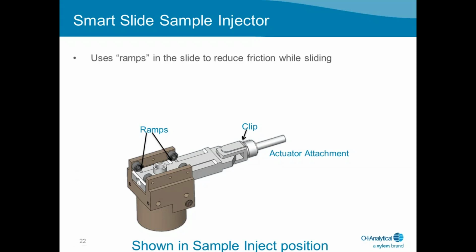Now we're talking about salt samples. Some residue containing salt will be left behind, just a small amount, as this moves back and forth. However, that abrasive quality of salt in a liquid sample is eventually going to wear on not only the slider, the O-rings that seal it, but the body of the cap itself. So in this scheme, relieving that pressure minimizes the friction, thereby extending the life of the cap, the slider, and the O-rings that are sealing the tube.